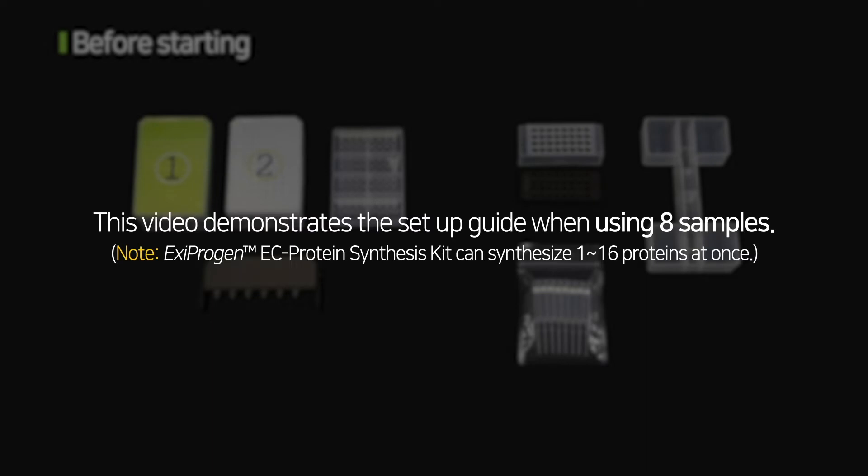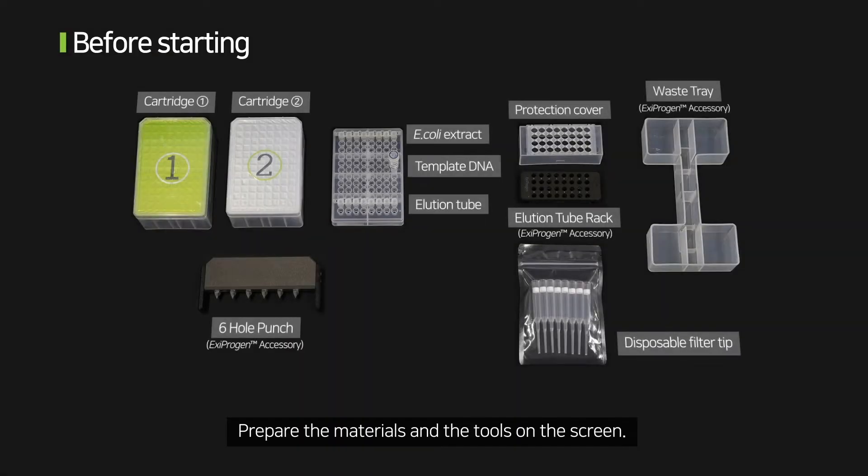This video demonstrates the setup guide when using 8 samples. Prepare the materials and the tools shown on the screen.